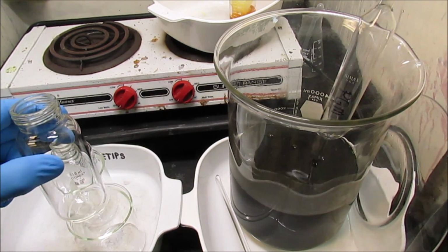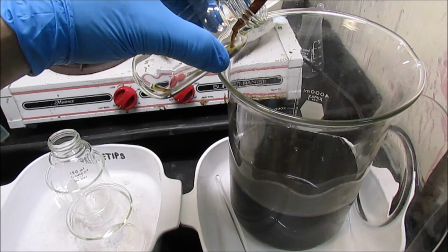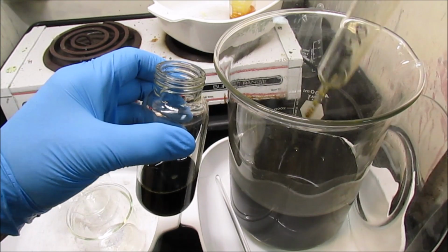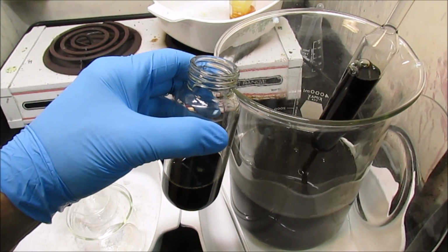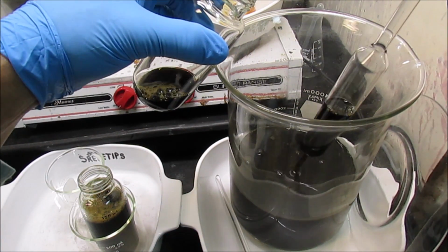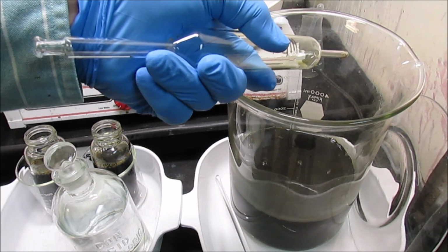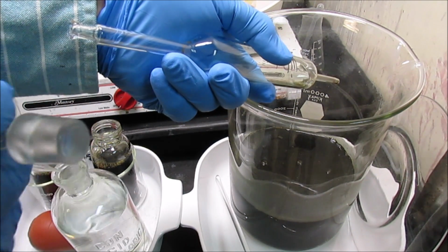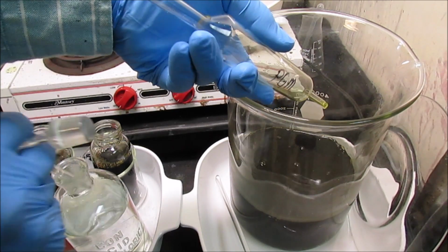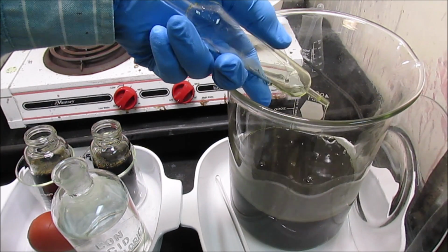So I'm going to spin a couple samples here and see what kind of stuff we have suspended in solution. It's like coffee. Here I'm using a little hydrochloric acid to rinse the inside of that pipette out. Using water does some strange things to the solution, so rather than use water to rinse the pipette, I'm using a little hydrochloric acid there.